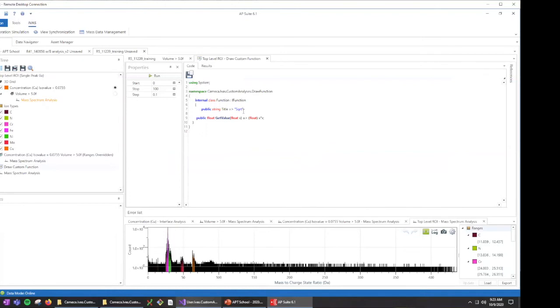We don't want to write a fully featured IntelliSense, providing fields and values for you, ourselves. Any IDE you want to use, Eclipse for instance, does this just as well as Visual Studio. So that's why we pulled the main part of the scripting out. You can still get to this scripting window; it's just self-contained within another module.